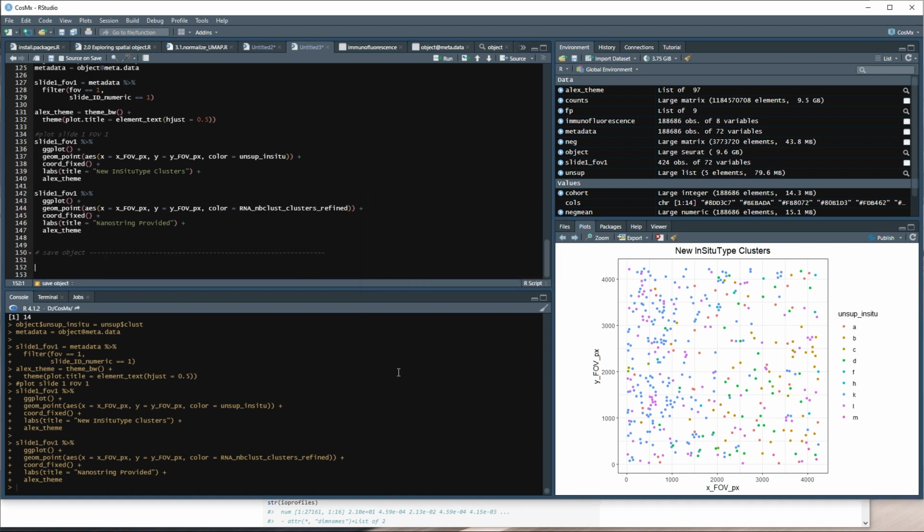Next time when we come back, if I'm able to get the phenotyping to work, then I will show that one. Otherwise, what we can do is run differential gene expression for all these different clusters and then go into the Human Protein Atlas and look at, okay, blue is showing a much higher expression of this gene. What kind of cell is that associated with? And we can curate the cell types knowing that these are coming from the brain. We're not going to look for skeletal muscle as a cell type.